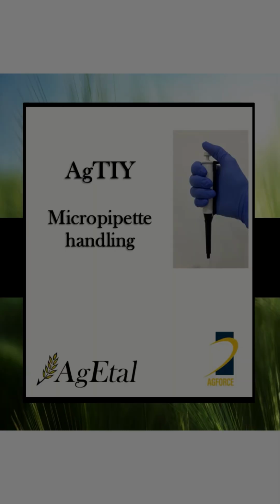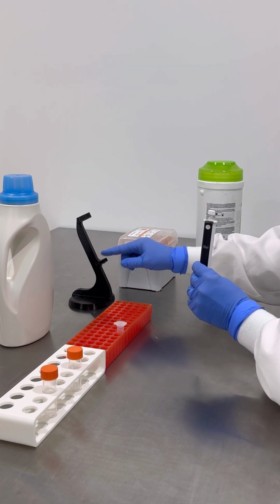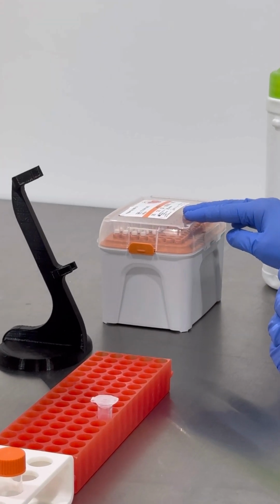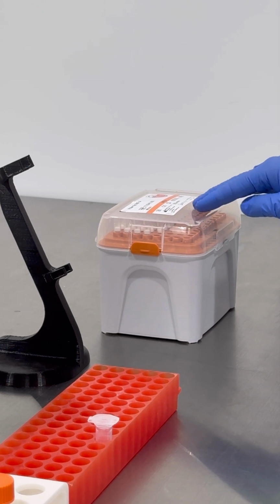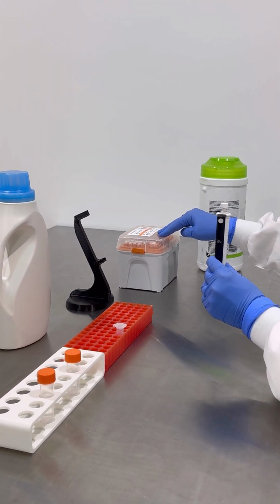Micropipette handling. This is a micropipette. Here is the stand for the micropipette. And this is a box of very clean, sterile tips. Keep the lid of the box always closed to keep them clean.